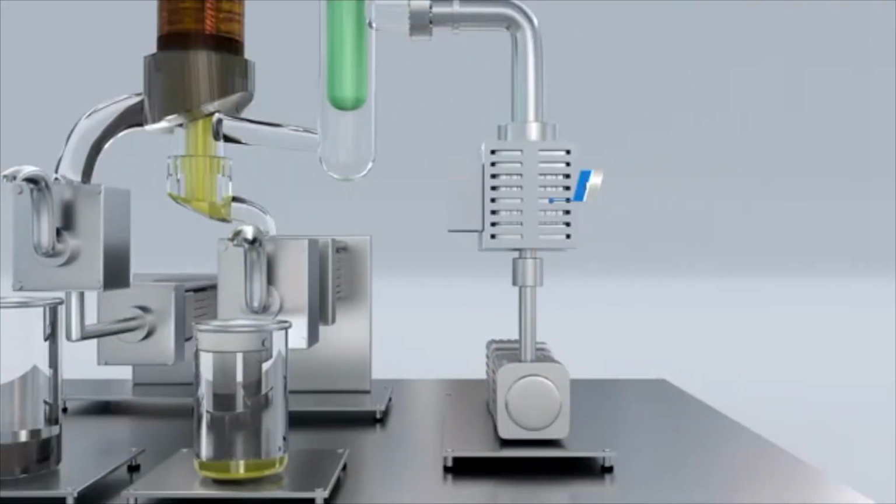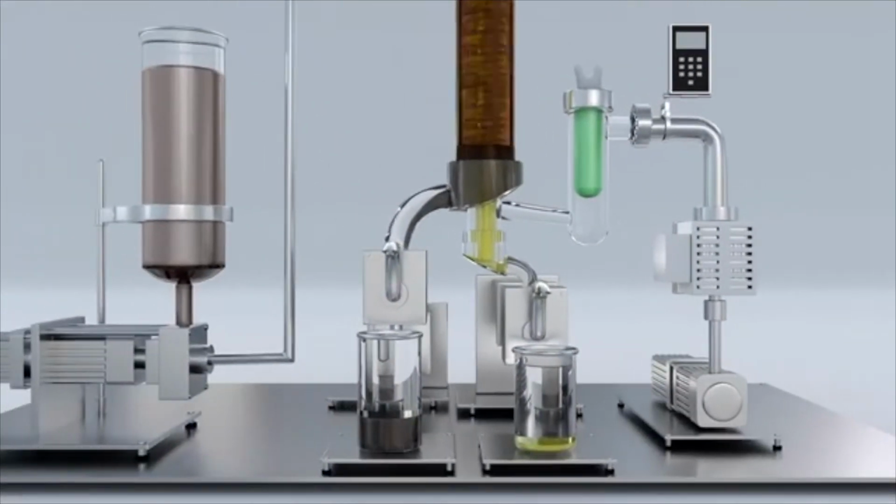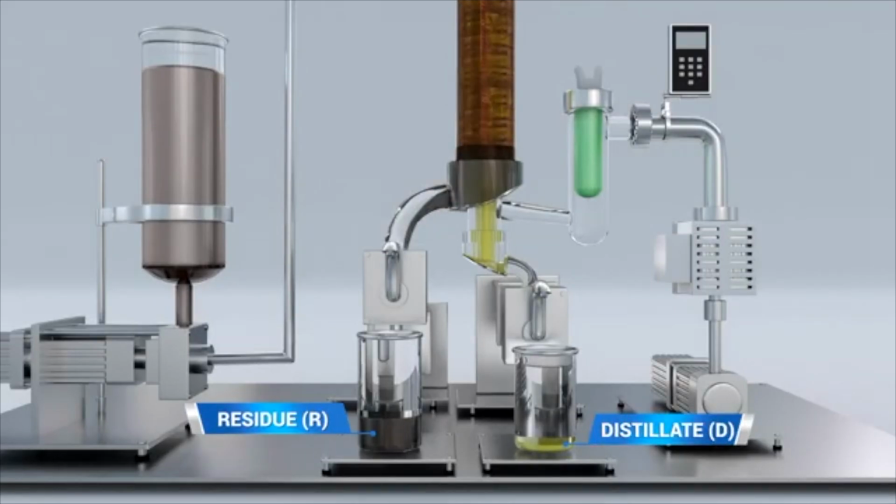So for instance, when you are distilling cannabinoids, you will obviously notice the terpenoid fraction coming off first, closer into the main body portion of the compound coming off second, and into the tails portion. All of these are directly correlated with the information that we're giving you here.